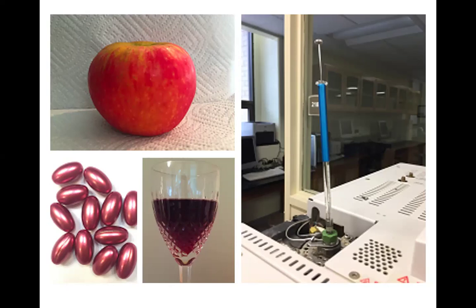And let's say the caffeine content is too low and you don't have that many samples, then the usage of extraction is also, apart from sample preparation, to pre-concentrate, because we know that some machines' capability in doing analysis depends on certain sensitivity. It means that if the content is too low, then whatever machine that you intend to use might not be capable of detecting the amount of caffeine in this case.